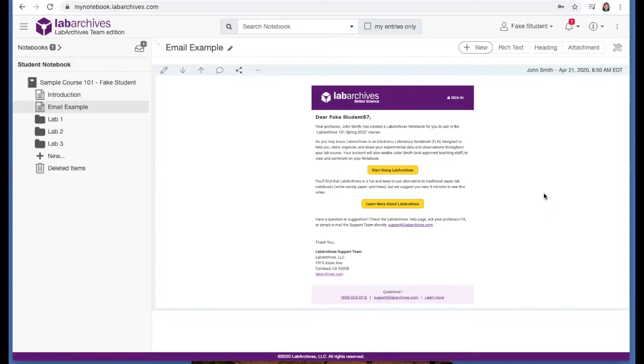When you log in, you may see an alert to pay for your course. If you don't pay past the grace period, your notebook will go into read-only mode.